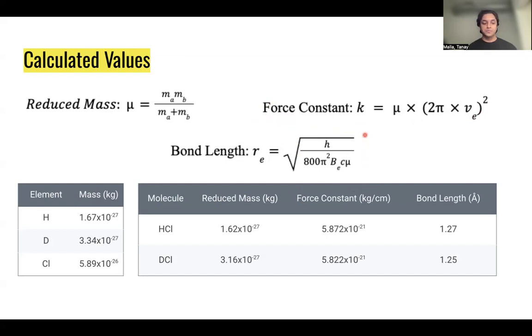In conclusion, we are able to effectively utilize IR spectroscopy to analyze the effect of different isotopes on rotational and vibrational transitions. We ultimately found that the isotope has significant effects on the vibrational and rotational coupling, but does not affect the bond elasticity or length. Ultimately, IR is a very useful spectrometer and can be used in a variety of different analyses.